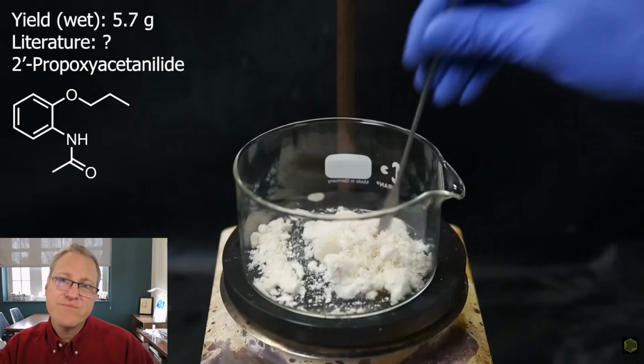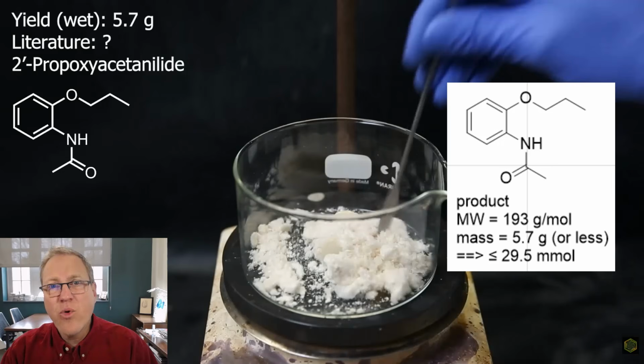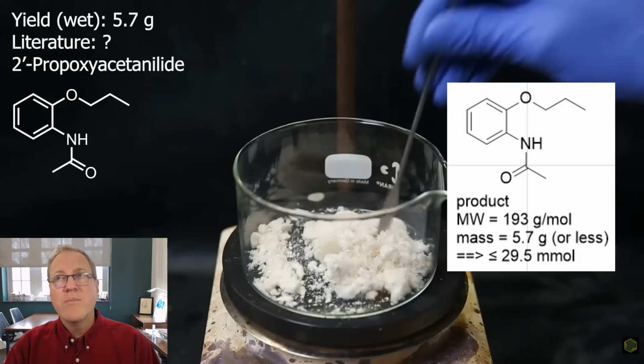Okay, so he has 5.7 grams of that material. It's probably wet, so he really doesn't have 5.7 grams of product. He's got a little bit of water in there. If you work out the molecular weight and all, that's less than or equal to about 30 millimoles, just under 30 millimoles of material. So remember, we were talking about having 50 millimoles of everything. We started with 47.3 of the key starter material.